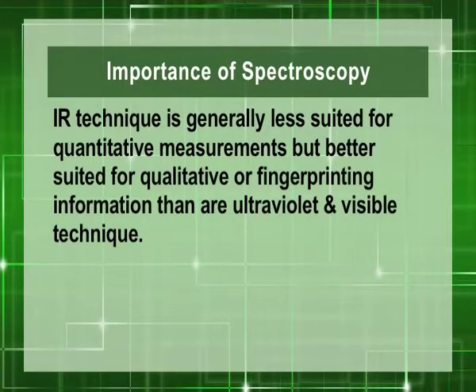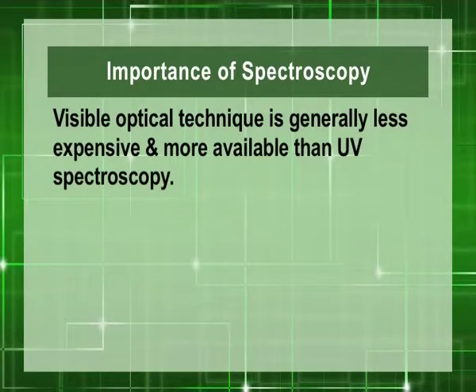IR technique is generally less suited for quantitative measurements, but better suited for qualitative or fingerprinting information than our ultraviolet and visible technique. Visible optical technique is generally less expensive and more available than UV spectroscopy.